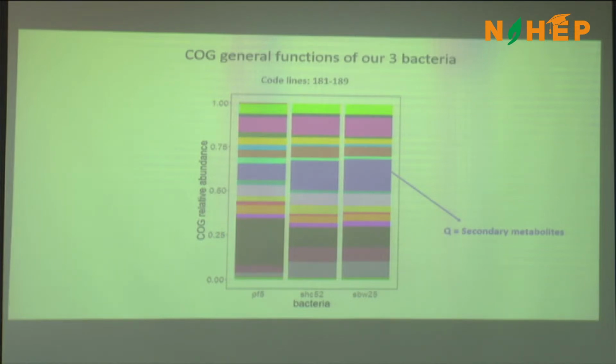Okay, wait. I think I forgot something. If you go to the first part of the code, you will see a region that says library and a lot of packages. It's because we forgot to load the packages. So my mistake. Go to the beginning. If you go to lines 17 to 24 and you run that chunk of code, you will load all the packages, okay? I forgot to mention that.